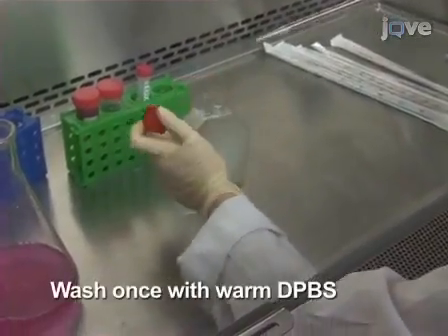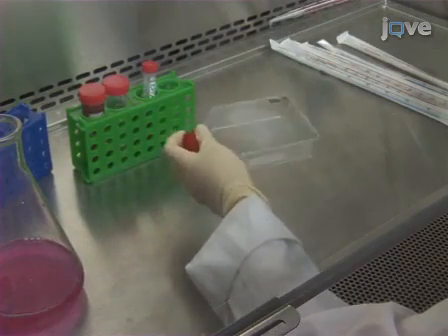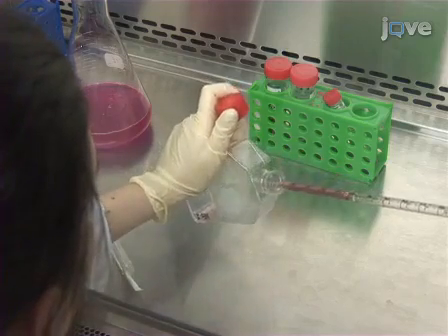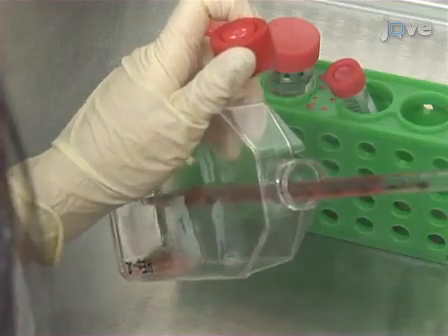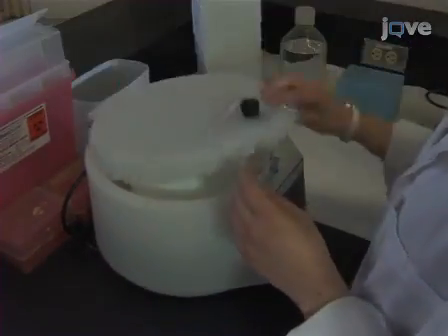The cells are ready for an assay typically once they have almost reached confluence. Wash them once with warm Dulbecco's phosphate-buffered saline. To detach the cells, incubate them with 0.05% trypsin EDTA for 5 minutes, then add fresh, warm, complete medium. Centrifuge the cell suspension at 2000 RPM for 5 minutes, then resuspend the cell pellets.